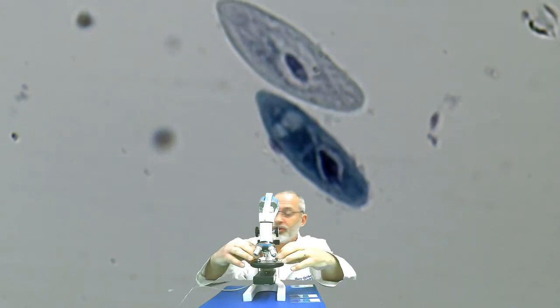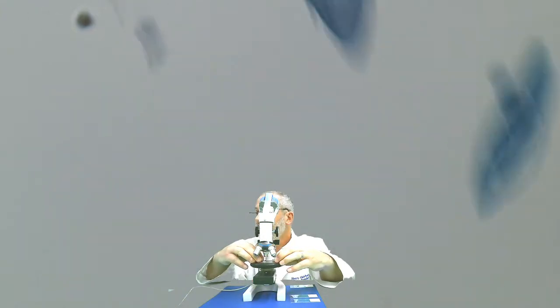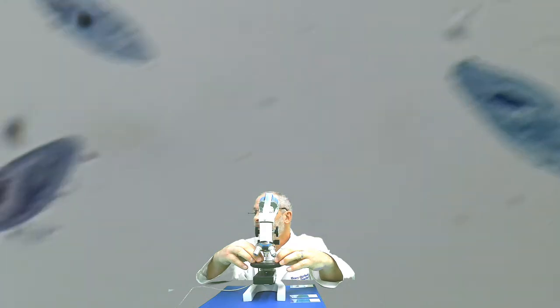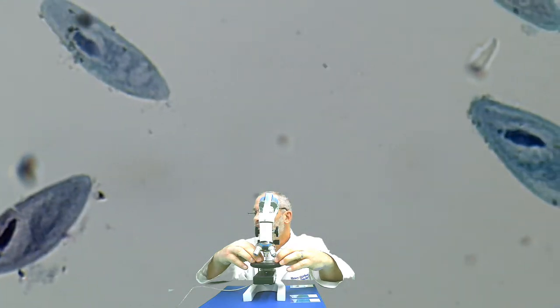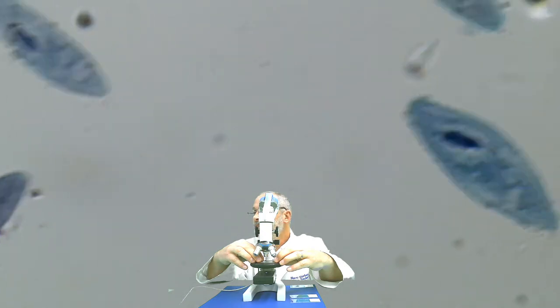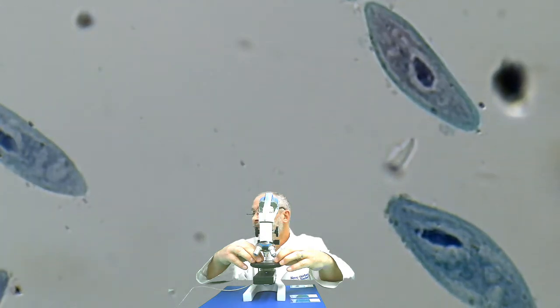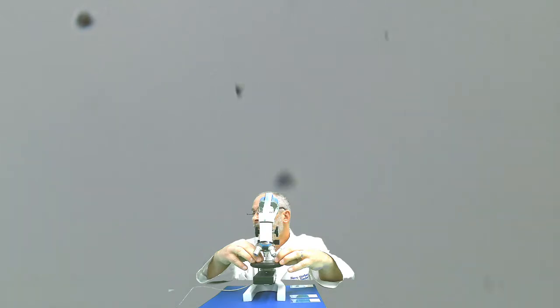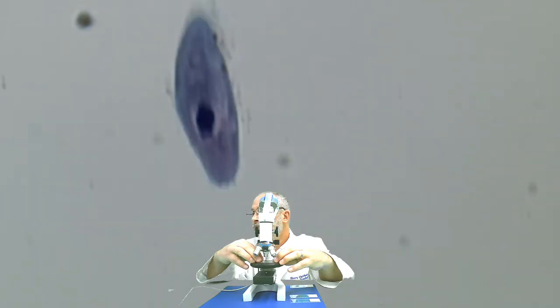And so while you are illustrating, keep in mind, here's some better ones here. The relative, oh yeah, all right, here we go. Oh boy, check these out. The relative sizes of these Paramecium while you are drawing them in your book.